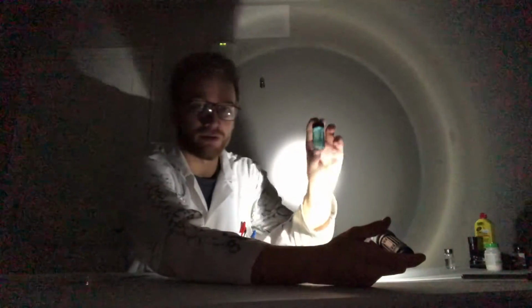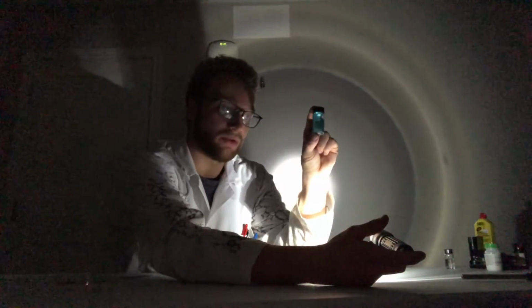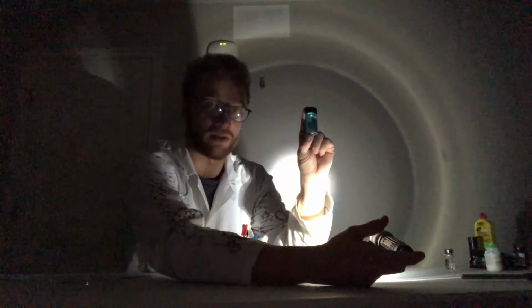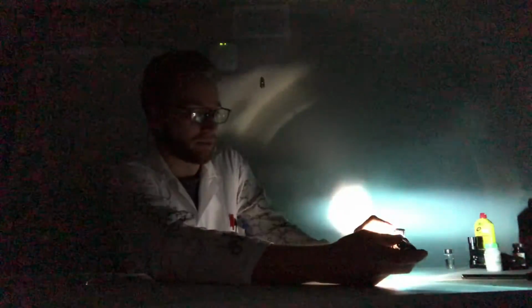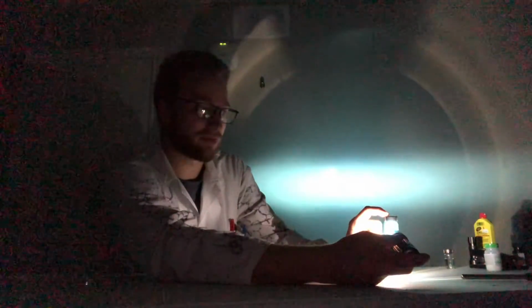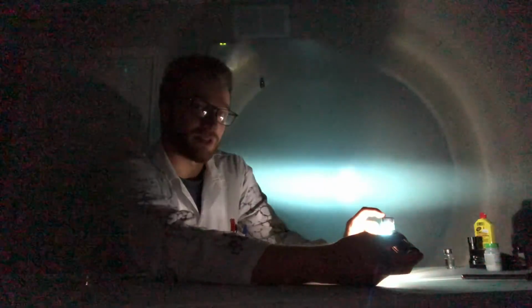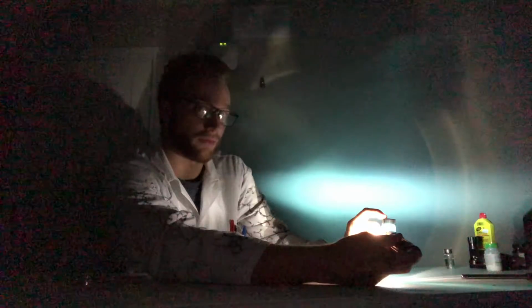I have also a solution of copper sulfate. Now, copper salts are blue, and blue solutions can absorb light and keep it from emitting the other side. Now, when I put the blue vial in front of the white light, you can see the energy on the other side becomes blue. The light emitted from the vial becomes blue. This is absorbing the light and emitting it at a different light, and thus not letting all the initial light through.